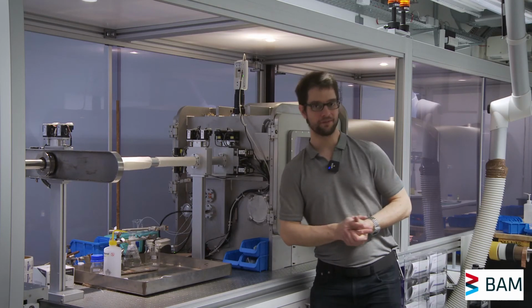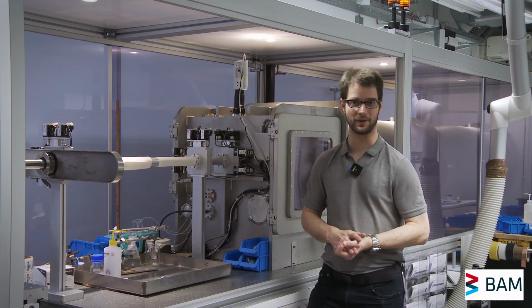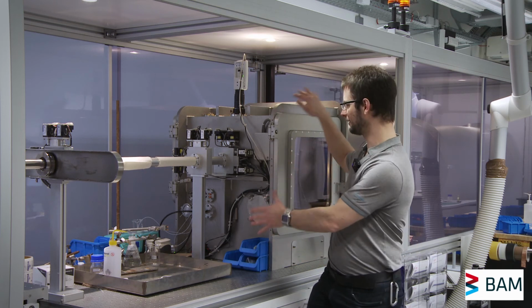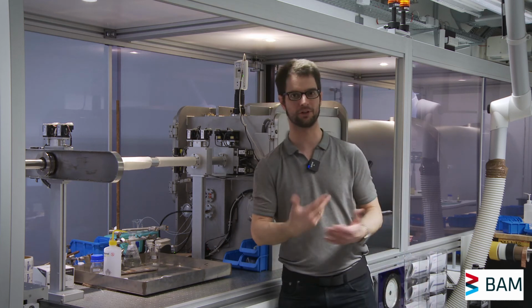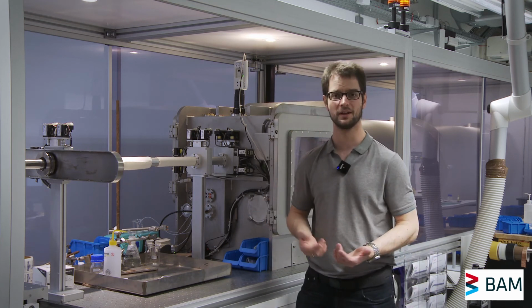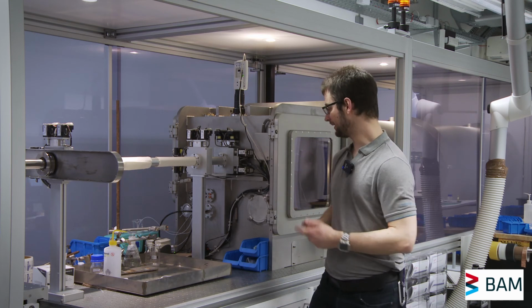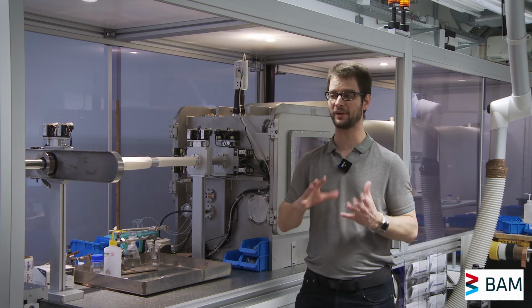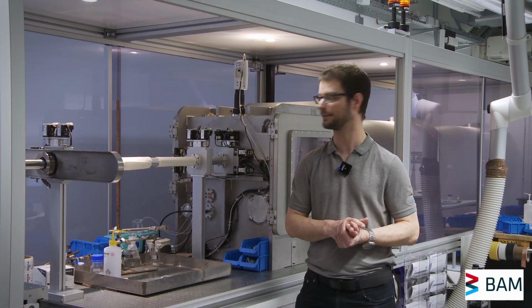So that was a brief overview of our instrument. As you can also see, we've started to heavily modify this instrument. We've taken away a lot of the pretty cowling which was around. We've started putting some extra flanges, extra feed-throughs in to run more and more varied experiments. In addition, we've been adjusting the software and we've replaced this largely with our own scripts at the moment to give us better measurements with more metadata.